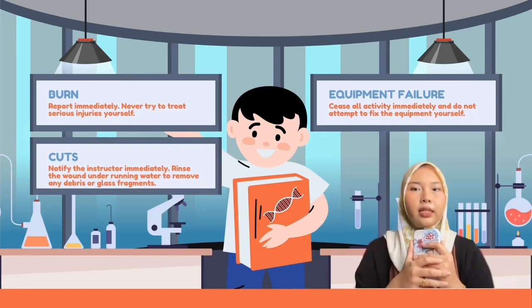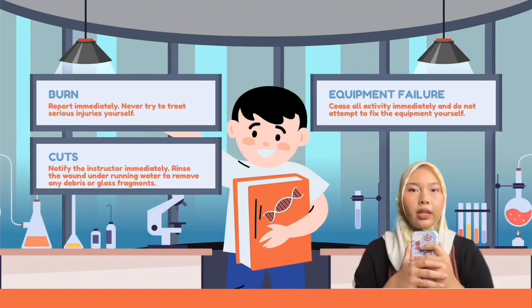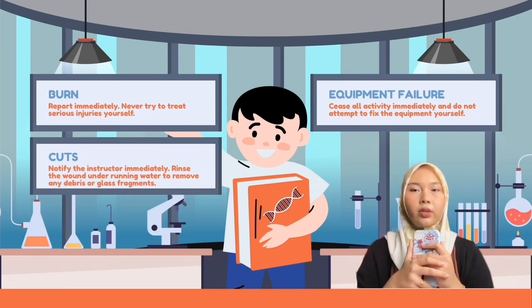This highlights the importance of proper training before using laboratory equipment. Users should always follow standard operating procedures and ensure equipment is switched off and clean after use.